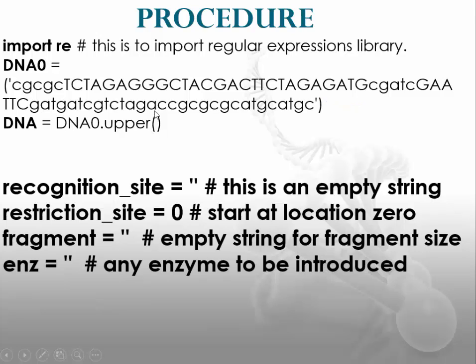So I actually inserted certain pieces of DNA where there are recognition sites of enzymes, like this one, TCTAGA. I put it here purposely so that I see where it is in the first place, and if it doesn't cut it, I would know that the function doesn't work.